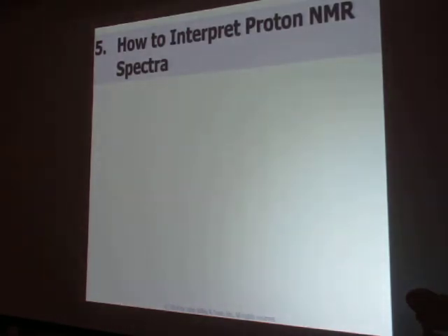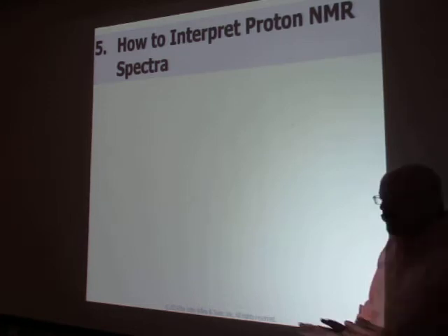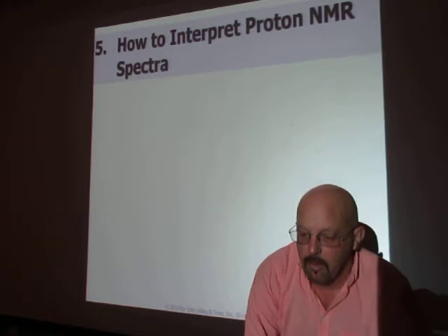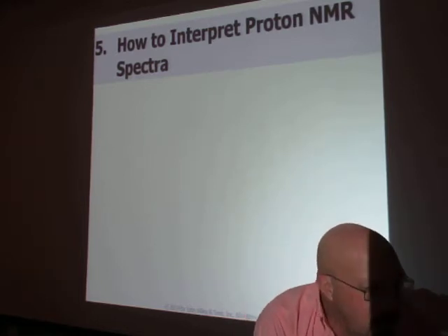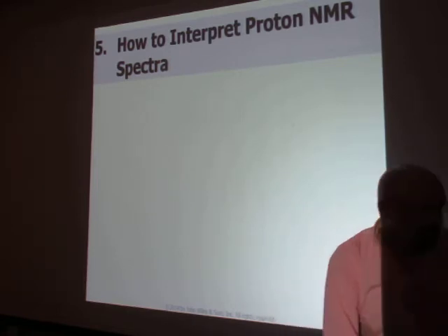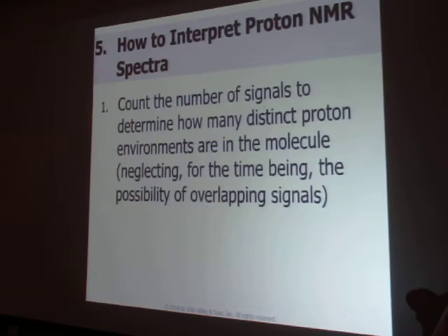Now, that finishes what I wanted to talk about there with protons. So let's go through and talk about how to interpret a proton spectra. We're going to go through an example here. How do you actually go through?